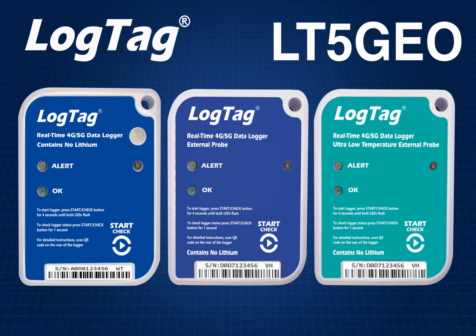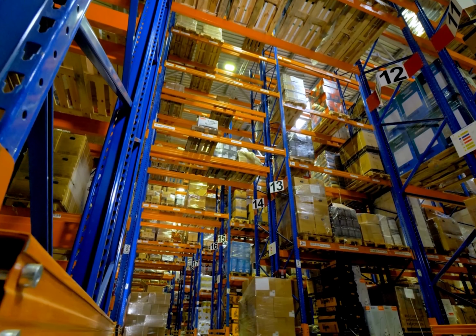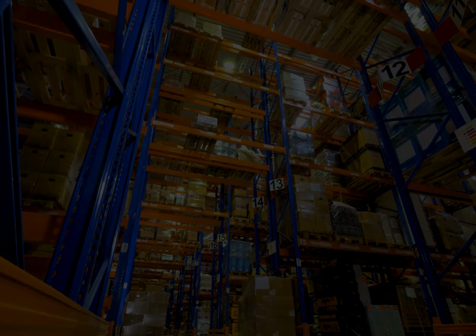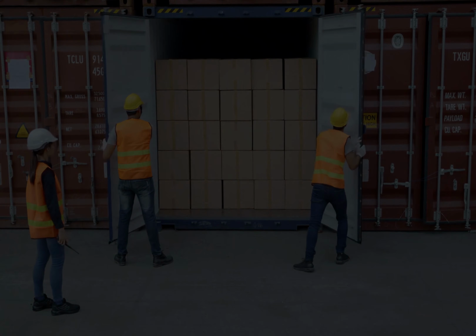The LT5GEO is designed for various monitoring needs. You can place it in your warehouse, cold room, or other storage areas to monitor your cold storage continuously, or attach it to a shipment to monitor your products throughout their journey.